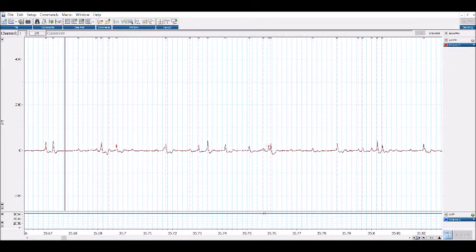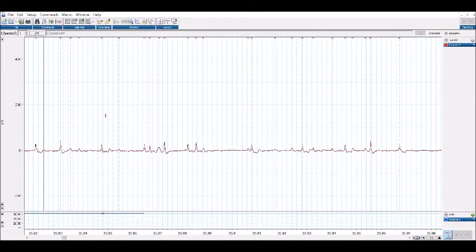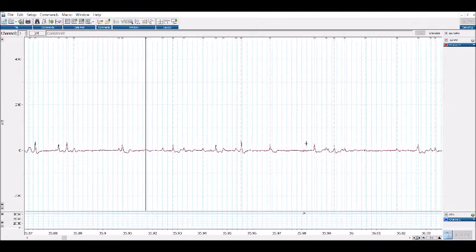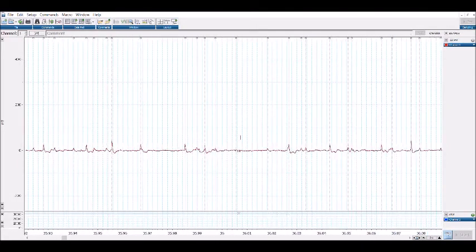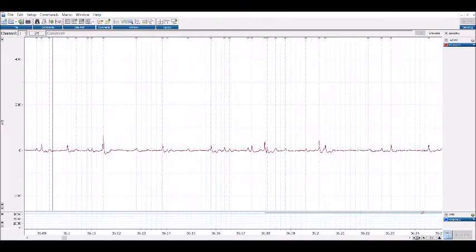2. 2. So you can see the problem that you run into with standard deviations is changing it just a little bit can get all of these problems too. This is definitely one that we don't want right here. So you hit a 2 for that. 2. 2 right here. 2.